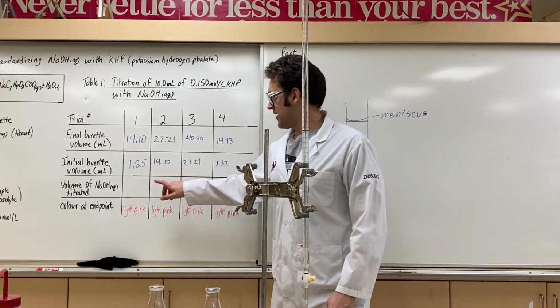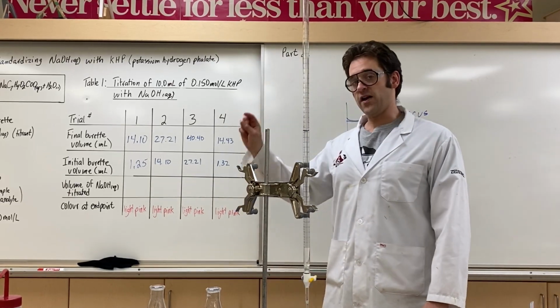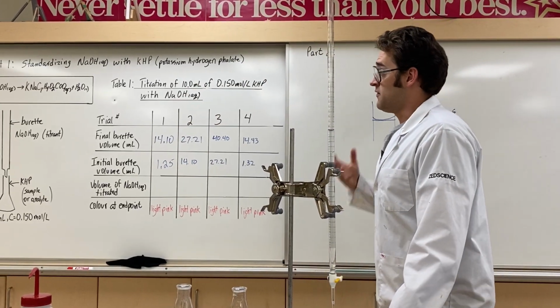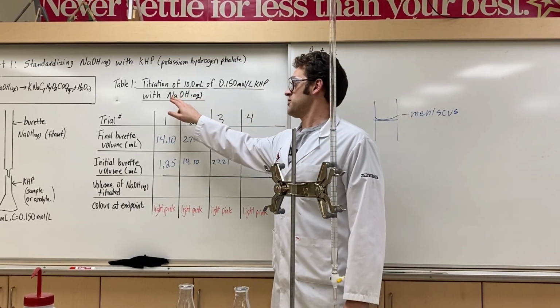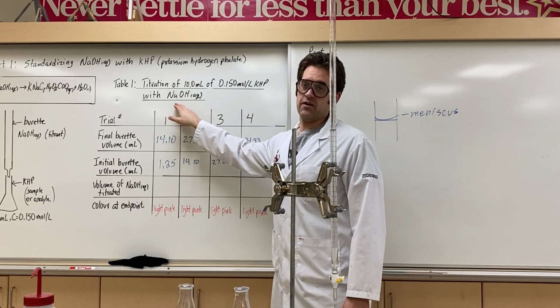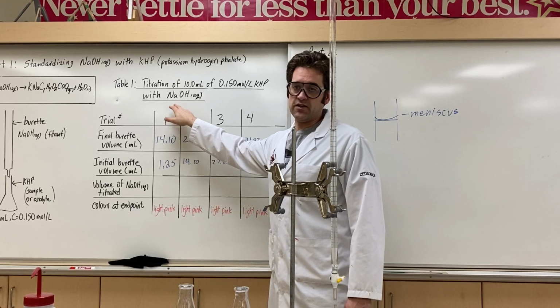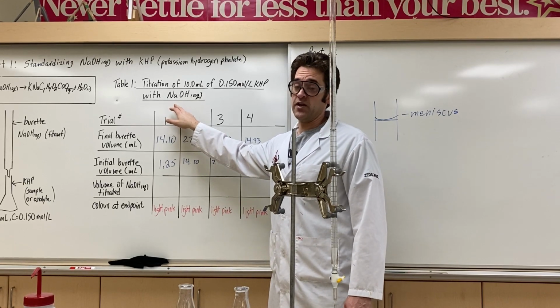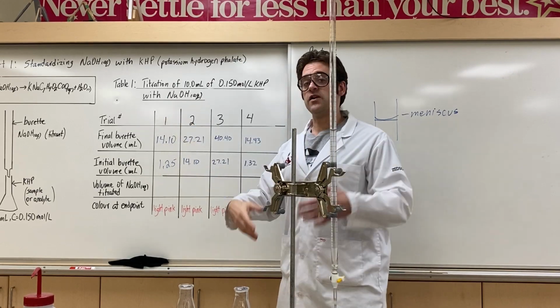So you guys will have to subtract the values, find the 3 best ones, and average those for the math to find the concentration of sodium hydroxide, because you will need that for the second step of this, which is the vinegar titration. And Zdog's gonna tag in here and explain the setup start for that. It's kind of the same thing, but it's cool because now that we know this, we can find another.